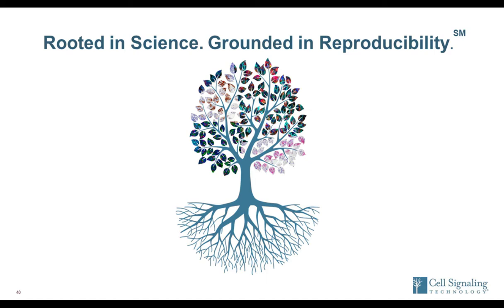M1 markers are a little harder to come by, but some possibilities that people might want to think about would be iNOS, CXCL10, and SOCS1. And then another option would be to use pan-macrophage markers such as CD68 in a multiplex assay.